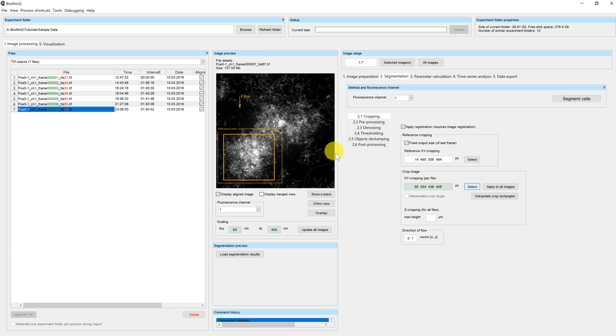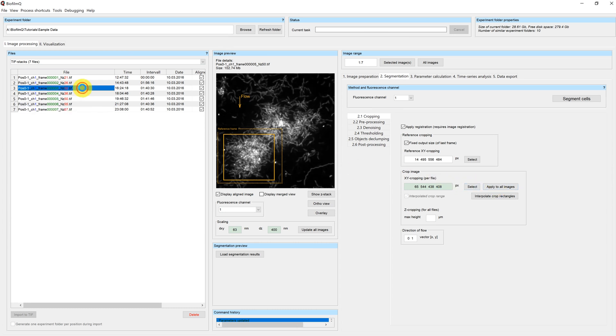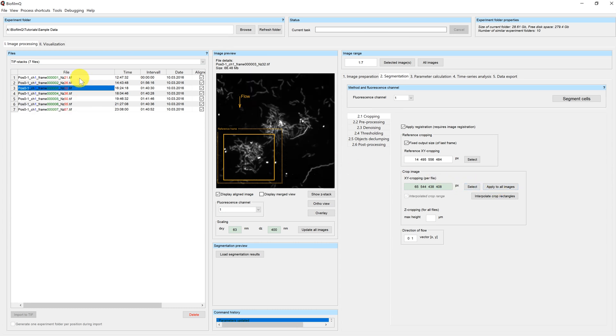So you can now click on apply to all images. Then this frame will be applied to your whole image series.